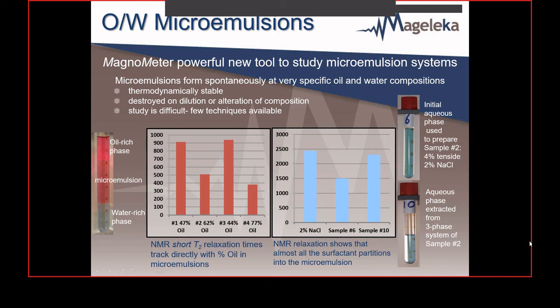But you can put a microemulsion into an NMR tube. The other thing is that microemulsions do tend to be totally clear, so you can hardly do light scattering on these systems. So characterization of a microemulsion is pretty problematic. You can, of course, use pretty complicated systems such as X-ray and neutron scattering, but again, these are not really well suited to standard laboratory analysis.